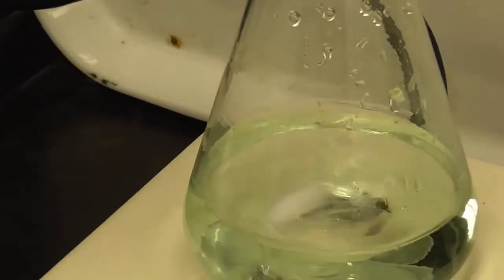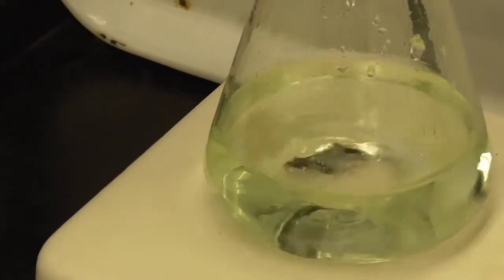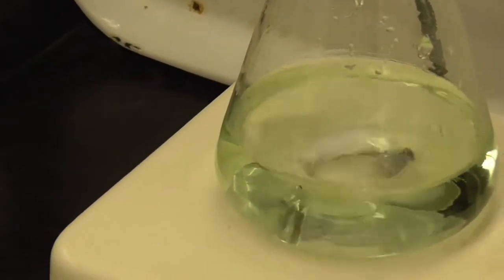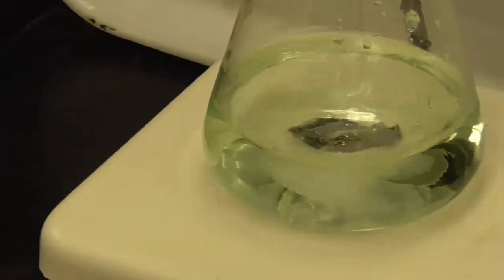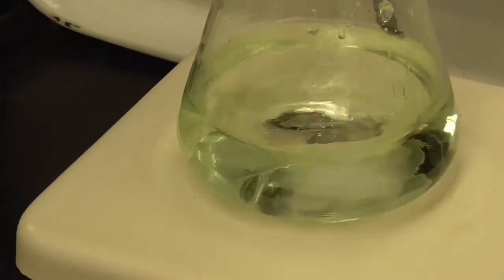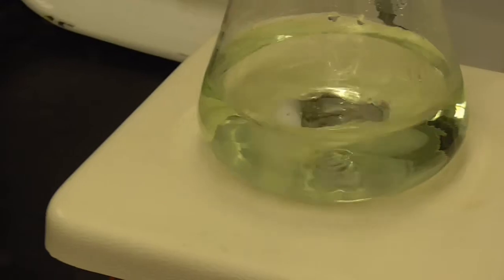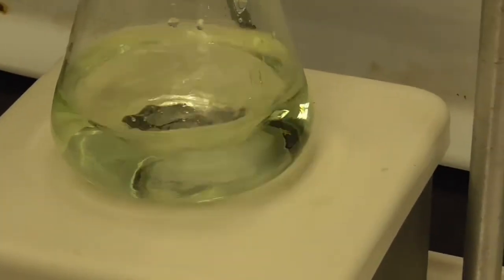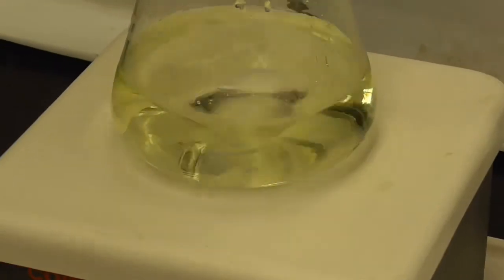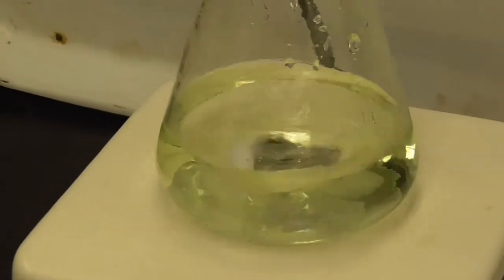Try adding one more drop. And it's wanting to fade back to green. Is it going to constantly fade back to green? Not constantly. I would say one more drop and you'll have your yellow. As long as it's there for a good long time, we're okay. It's kind of fading back to green yet. It's not the yellow that it was. Okay, I think it's staying there. So let's see if we can read this endpoint now.